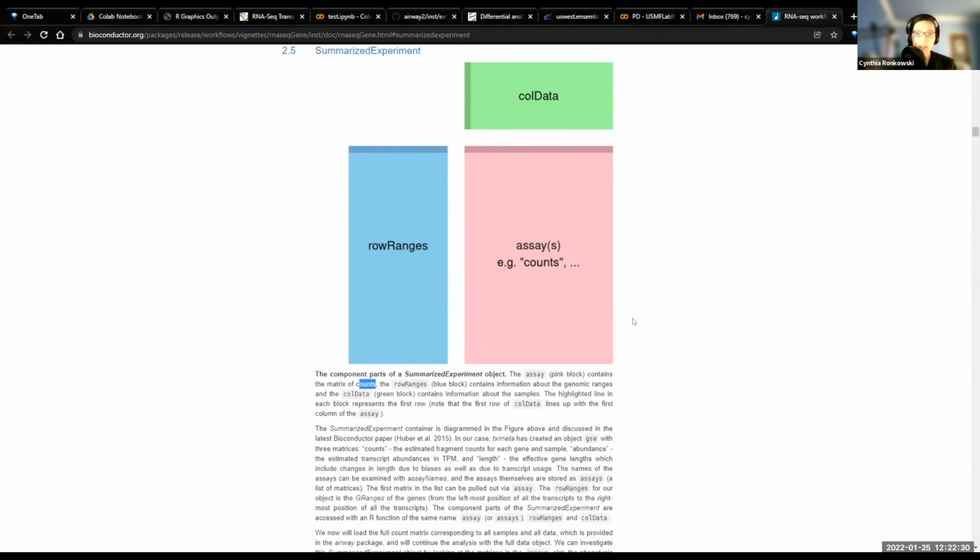And as you look in the assignment, it orders those counts based on expression level and picks the 25 highest. Yes, I have seen the first 25. Yep. So these are the first 25 genes with the highest variability. Yes, with the highest expression.